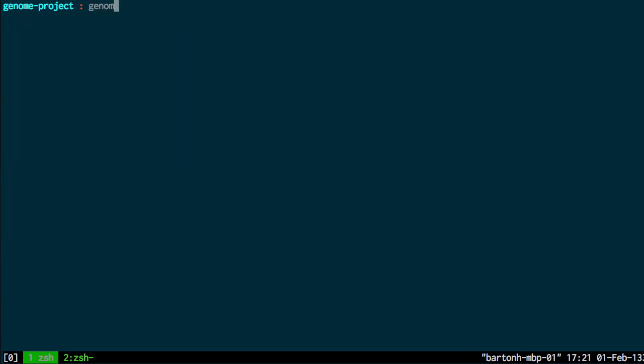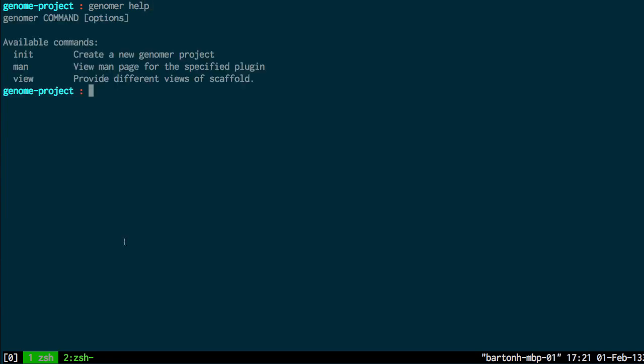So now if I run the genomer help command again, I see I have an extra command, the genomer view command which is now available, which provides different views of the scaffold.